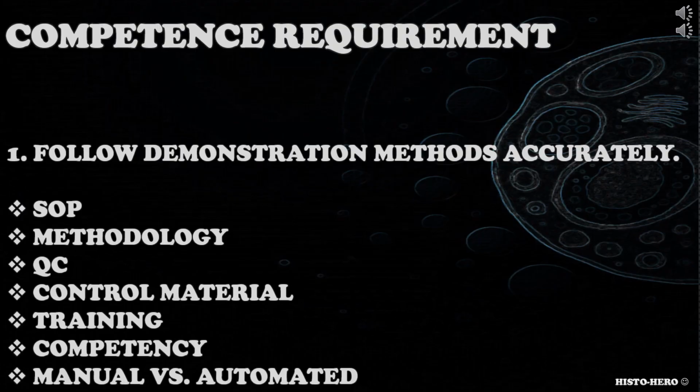Competence requirement is basically a combination of knowledge, skills, and experience candidate needs to perform a job to a satisfactory standard. Candidates' chosen evidence should demonstrate these competence requirements. The following competence requirements need to be met for this subsection. The first competence requirement is follow demonstration methods accurately.